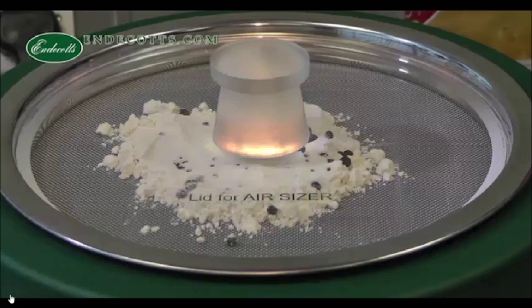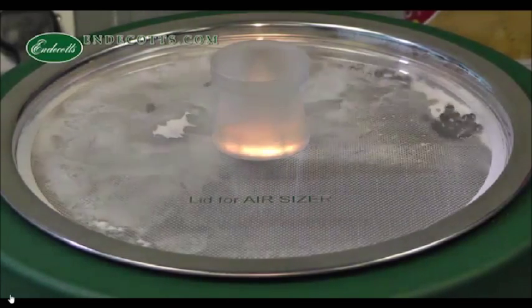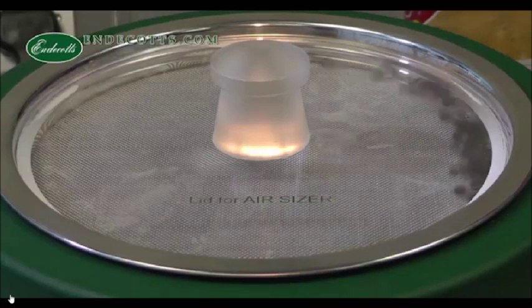Therefore, you can analyse your material and your particle size distribution. I switch the AirSizer on and you can see that the rotating arm rotates, emits a jet of air, and the suction behind the vacuum cleaner will suck through the undersized material.